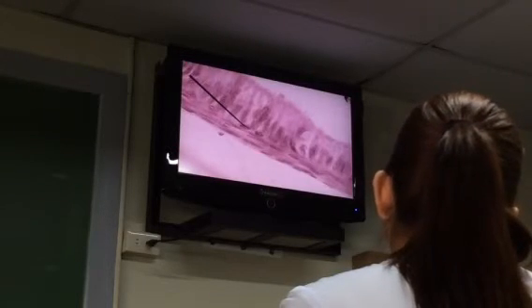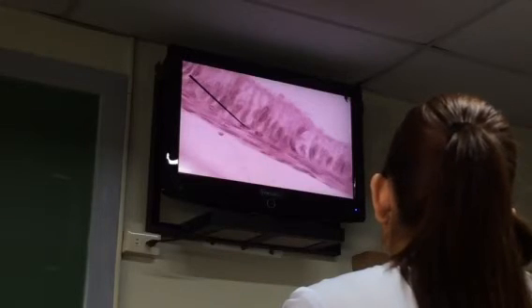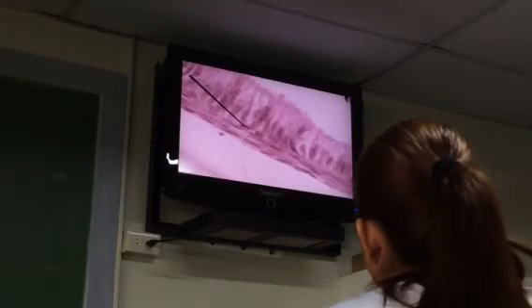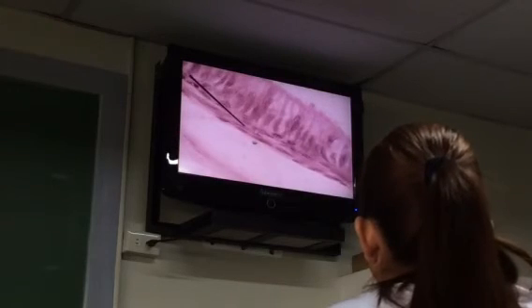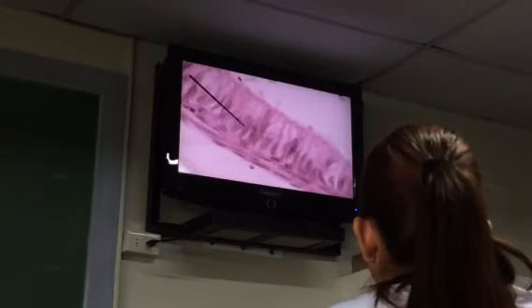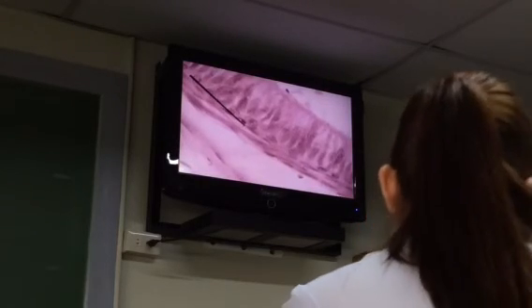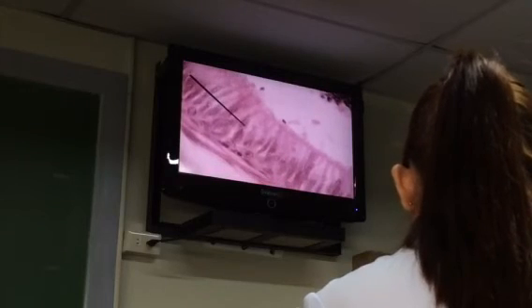Bakit halo siya? Why is it called halo? Is it light? Pale? It's supposed to be a pale cell with, ano ba siya? Diba siya yung mga lymphocytes? Aralin ulit. Tanong ulit kay Dr. Bardenosa. Okay? So that's the third cell, your halo cell.